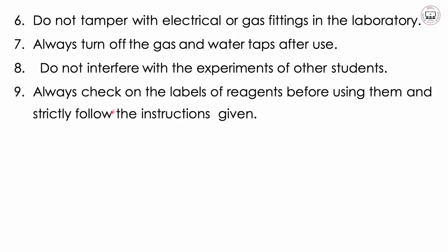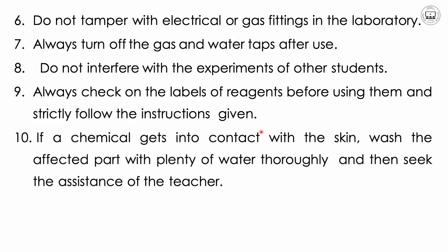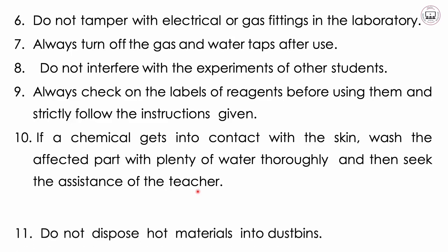Then 9, always check on the labels of reagents before using them and strictly follow the instructions given, because you might be using things which are not under the experiment. Then 10, if a chemical gets into contact with the skin, wash the affected part with plenty of water thoroughly, and then seek assistance from the teacher.